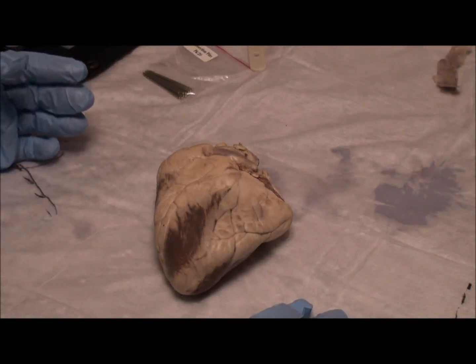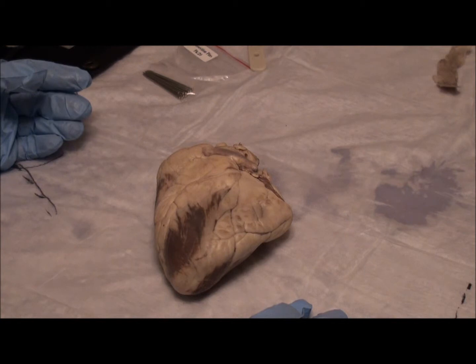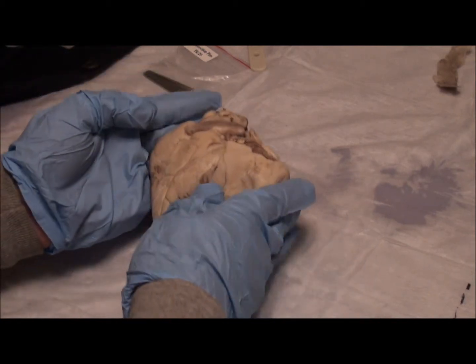This is Fred Hopkins, and this is my sheep heart dissection video. First, I'm going to go over the external anatomy.